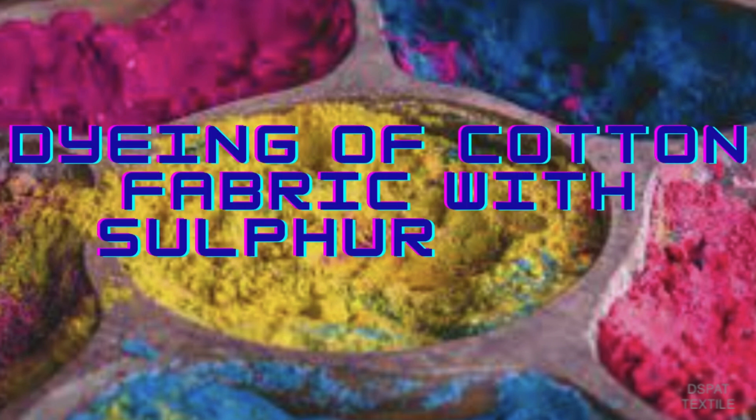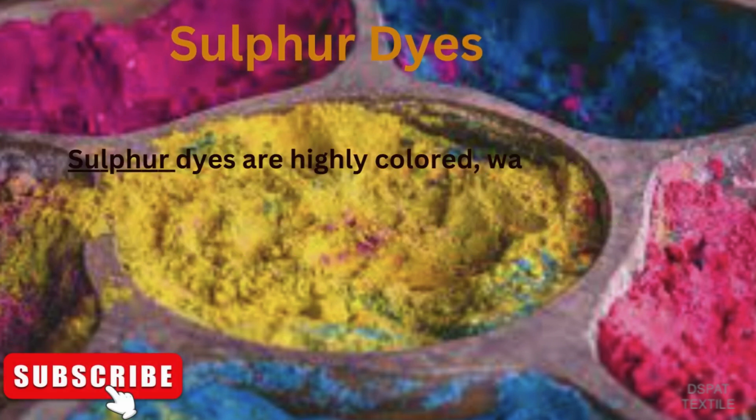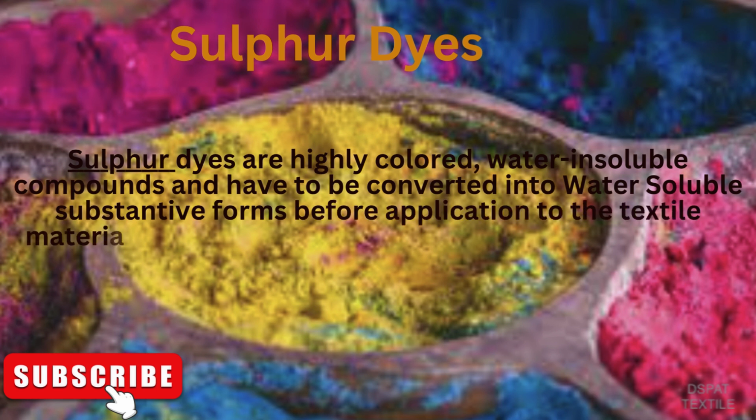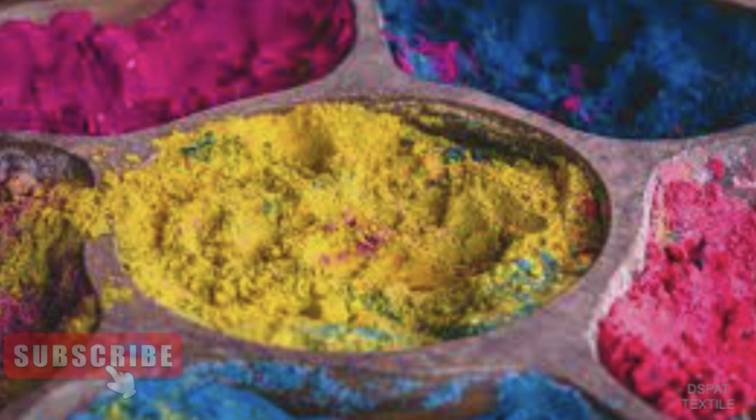Dyeing of cotton fabric with sulfur dyes. Sulfur dyes are highly colored, water-insoluble compounds and have to be converted into water-soluble substantive forms before application to the textile materials. This conversion is carried out by a treatment with a reducing agent like dilute aqueous Na2S.